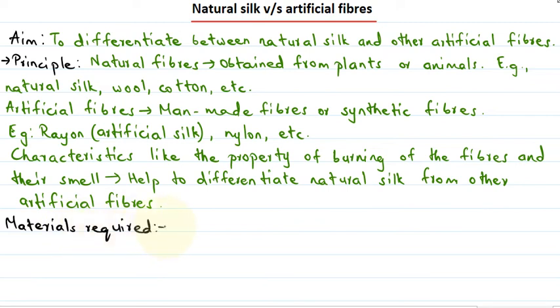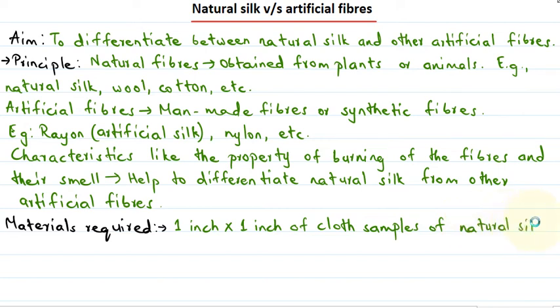So we would require 1 inch cross 1 inch cloth samples, and these cloth samples would be of natural silk, wool, nylon, rayon.